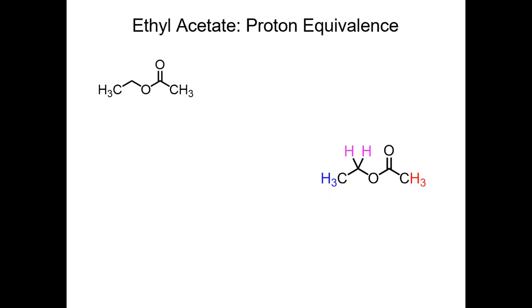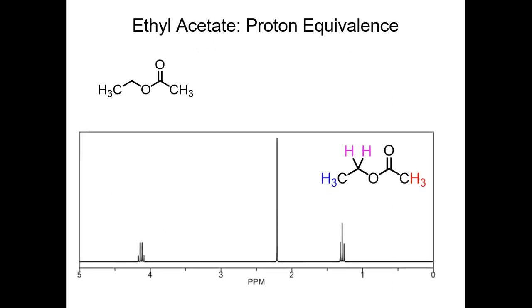Right, so if you watch the video, you saw this already. So when we talk about this, this is ethyl acetate. If you see here, you got 1, 2, I color-coded the protons, right, on purpose.